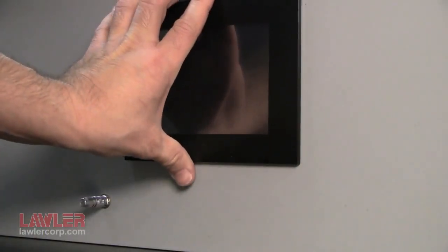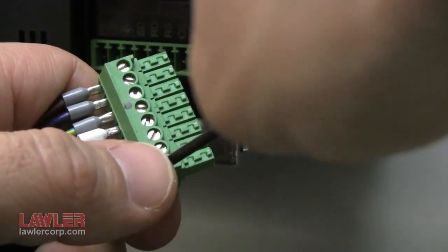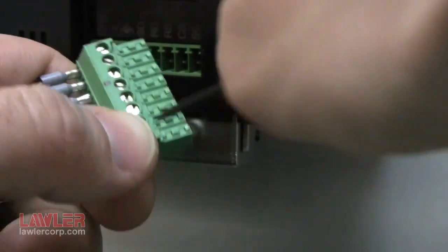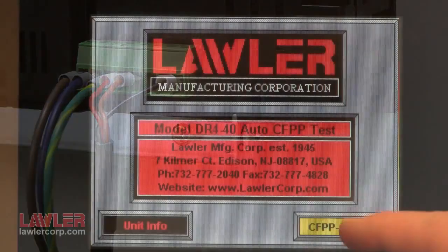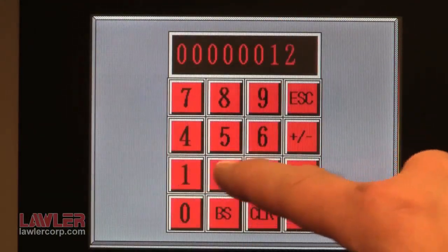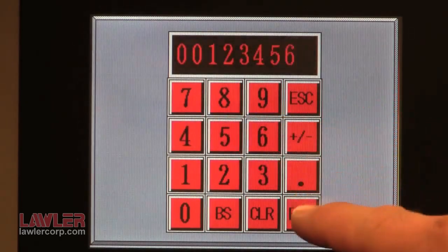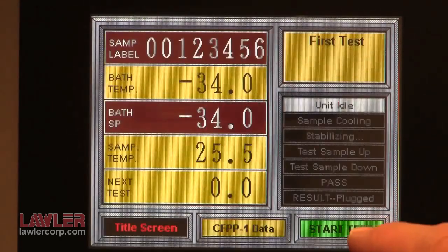Another common element is the control and display. The latest DR4 series has no custom boards that might become difficult to support years from now and no embedded or external computer which are prone to hard drive crashes and operating system problems. Instead, Lawler uses an industrial off-the-shelf logic controller and color touch panel. They are very robust, made by a leading brand and common to many Lawler instruments.